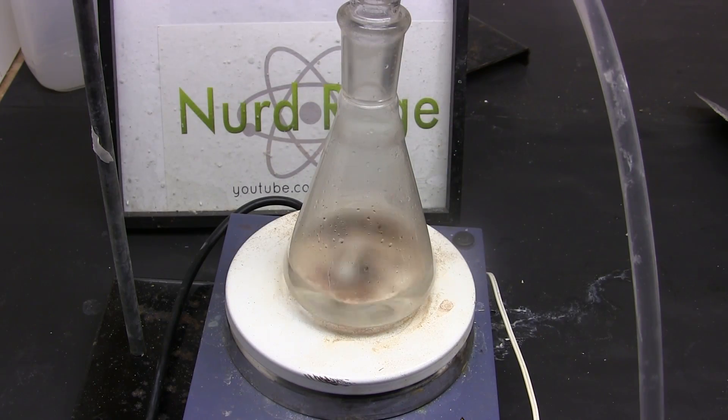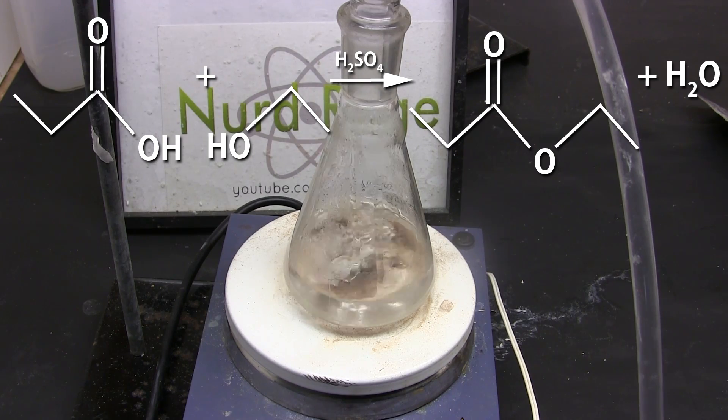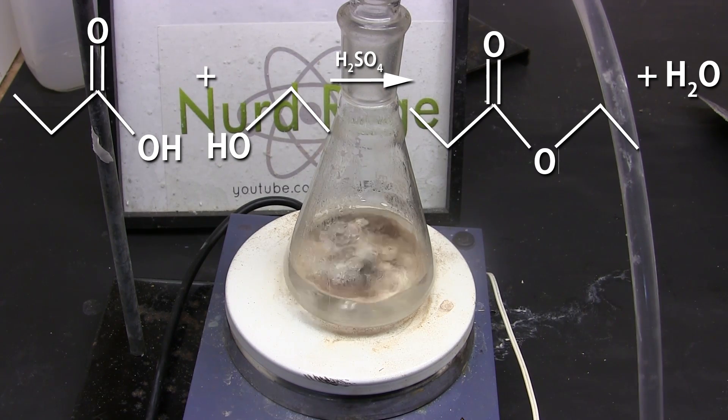Gently start refluxing the mixture. What's happening is we're reacting the propionic acid with ethanol to form ethylpropionate and water. The sulfuric acid acts as a catalyst.